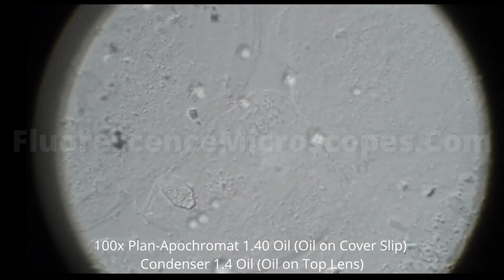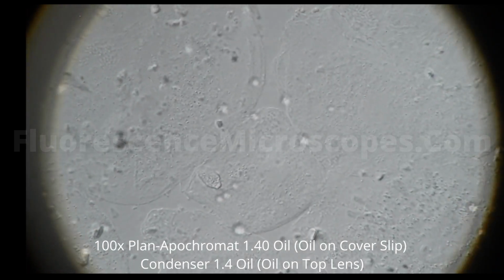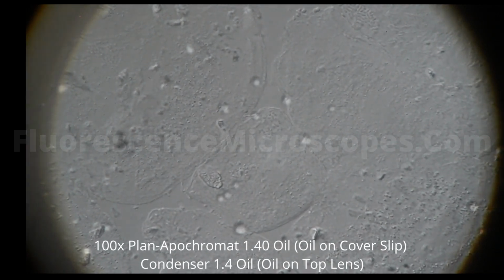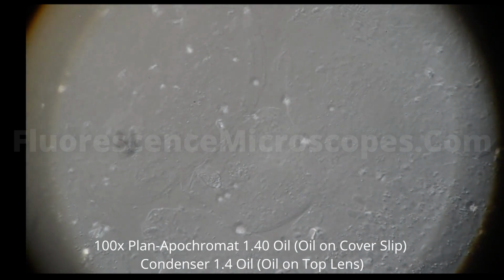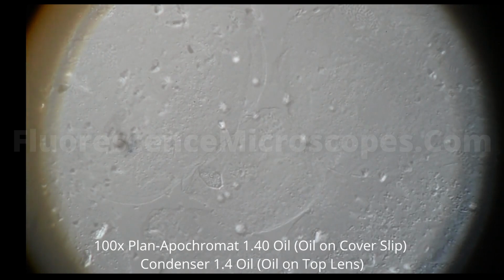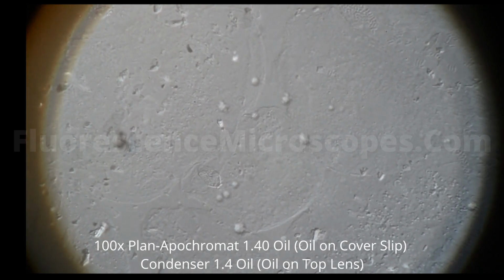I'm going to zoom back out, and I'm going to adjust my DIC. We are in a negative bias at this point.